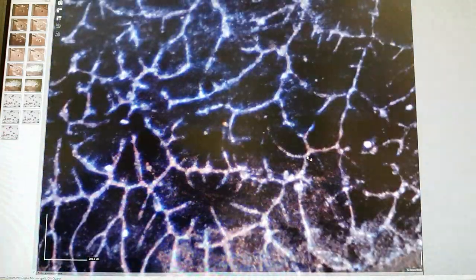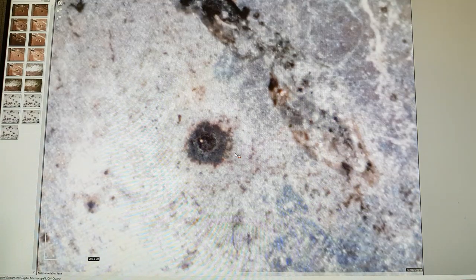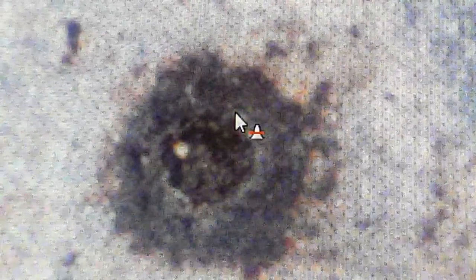That is what I couldn't stop myself from sharing with you today. There's the tail end. We have a look up at the head, and I'm going to show you the head here and change the polarization so you can see what is going on in the spot. Look at that — what have we got in the middle there? Are we seeing a piece of like a sphere or something in there, in this central area here? I don't know.